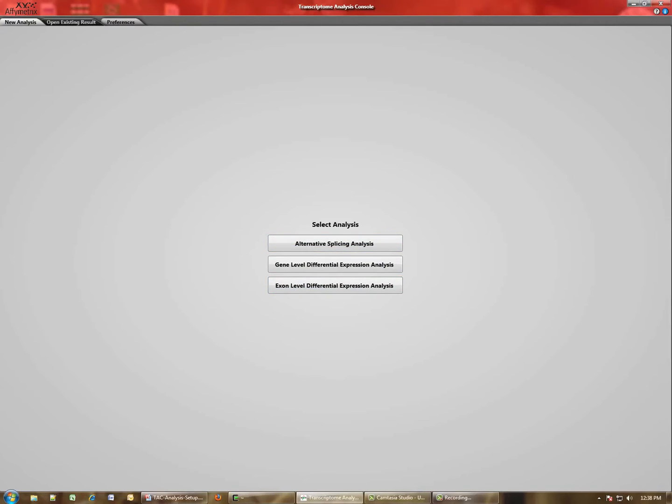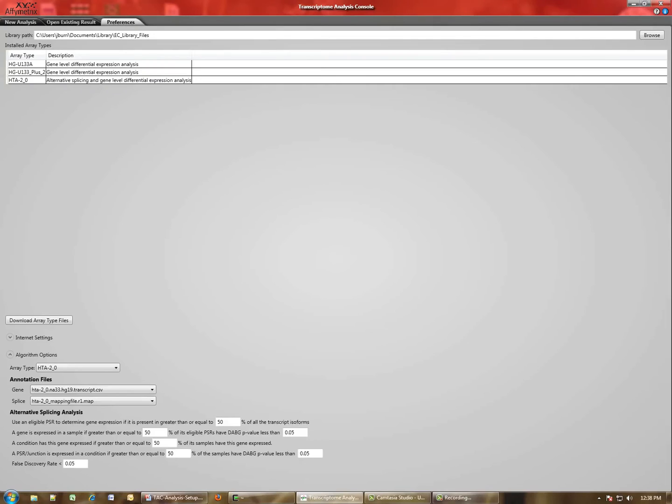Before we do that, however, I'm going to take you on a short tour through the Preferences dialog. Here is the page that you need to use in order to obtain the necessary files to process the arrays. At the top, you can define a library file folder.